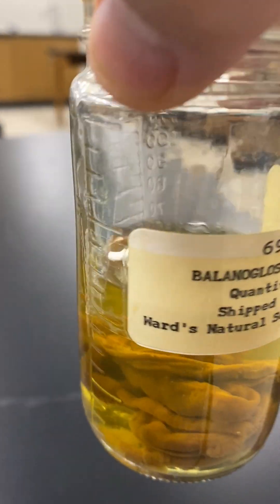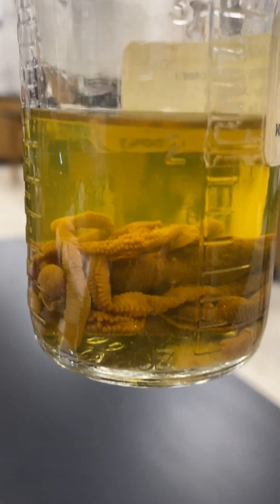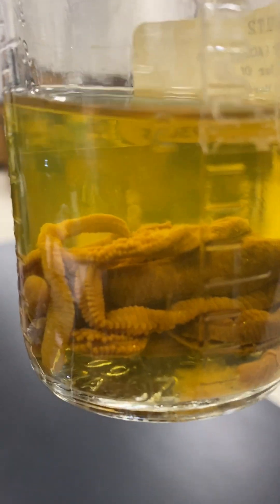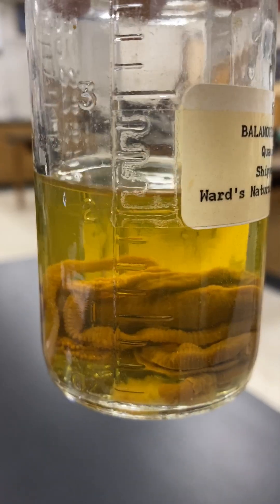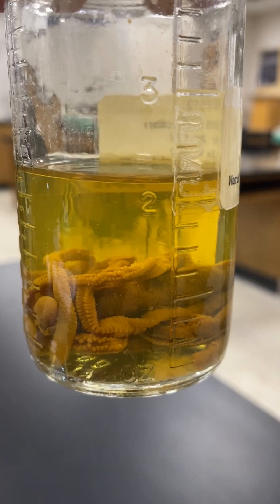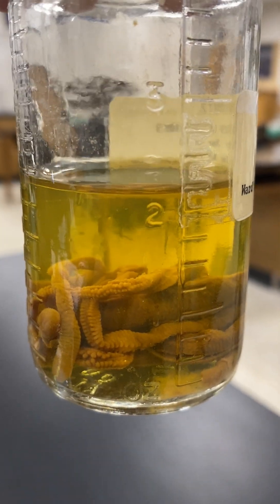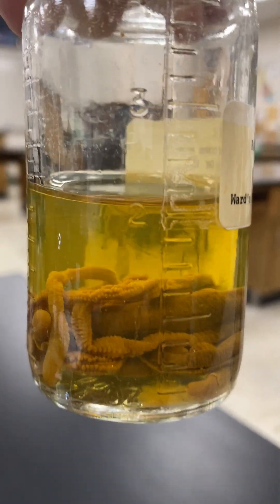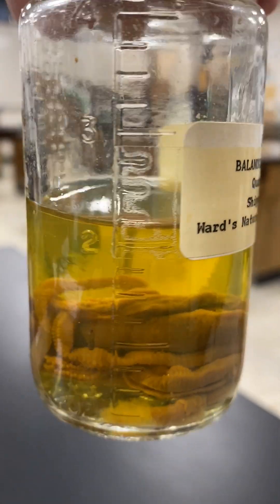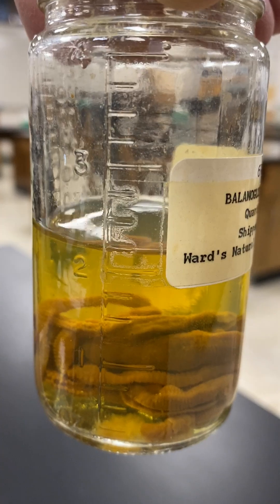If you take a look at the specimens in this jar, actually look at the fluid — the fluid is discolored yellow, and that discoloration comes from brominated compounds produced by these worms. The bromine in these compounds gives the water the yellow color, and if you could smell this, you'd be able to smell the bromine that's in solution.